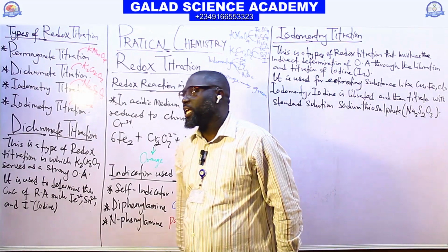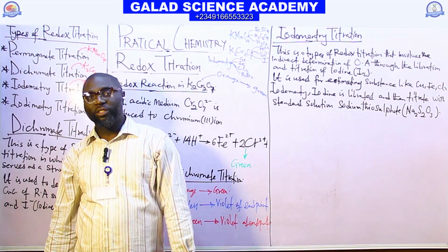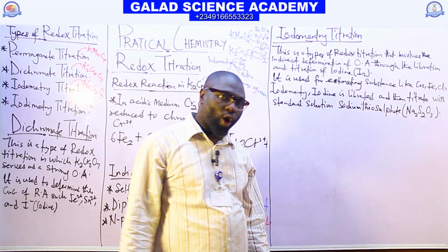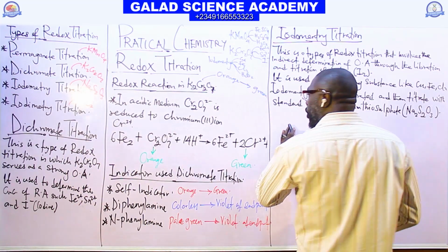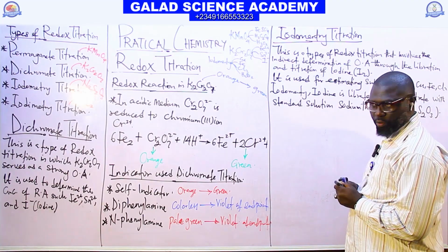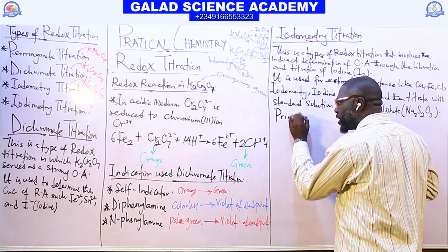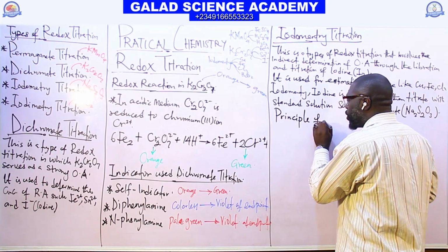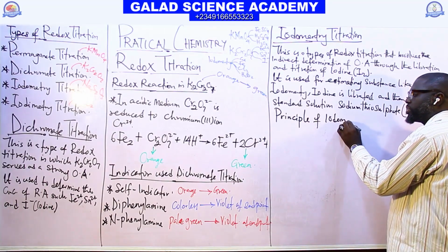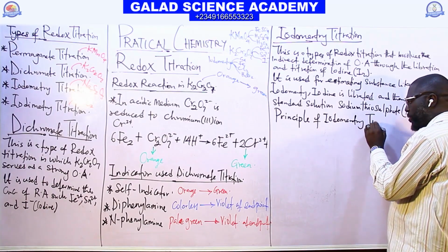Let us look at the principle of iodometric titration and the reagent and the indicator we use in iodometric titration. What is the principle of iodometric titration? Principle of iodometry titration.